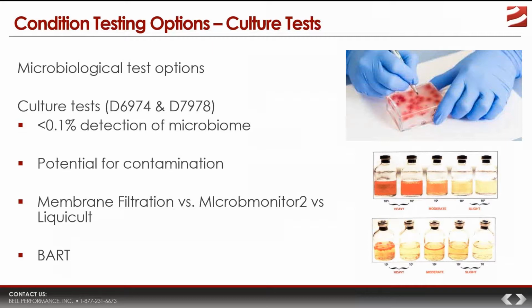There are three main types of microbe detection tests that we would consider. This does not count the ultra complicated genomic tests, done in a genetics lab, and those are actually the most accurate. But when it comes down to it, they're rather specialized and they're rather expensive.